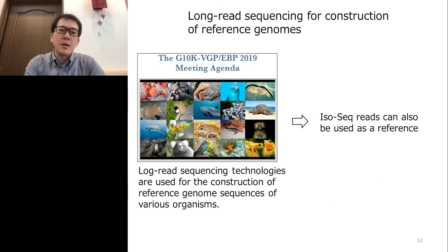By the way, in general, long-read sequencing technologies are used for the construction of reference genome sequences of various organisms. So we considered that IsoSeq reads can be used as a reference.